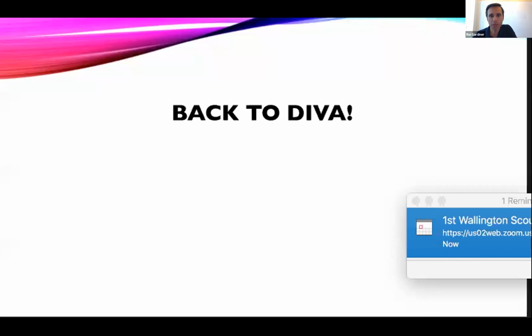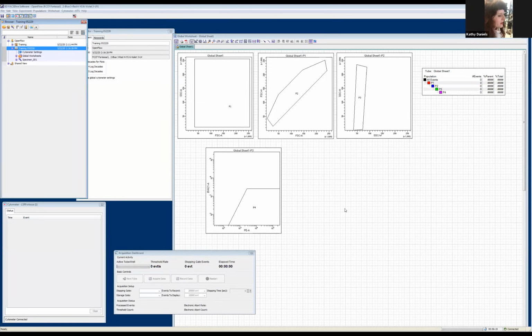So one of the questions was, somebody noticed that you used four decades and not 5. Any specific reason there? I'm sorry, can you say that again? Yeah, somebody noticed that you used 4 decades and not 5. Any specific reason for that? There's no specific reason. It's purely visualization.